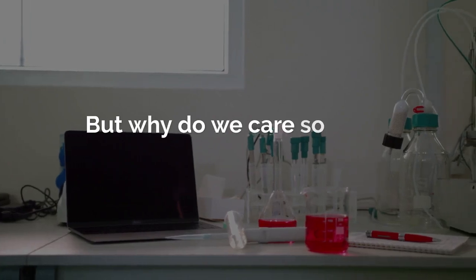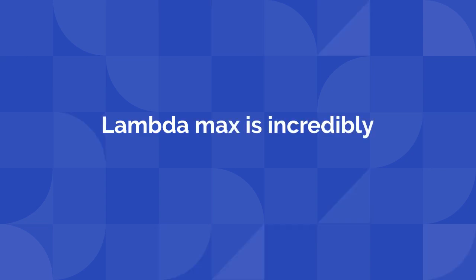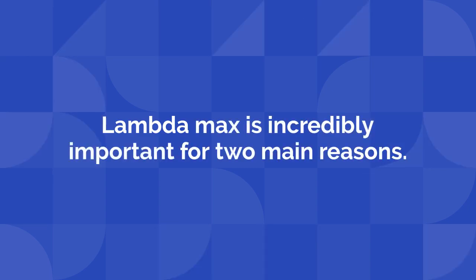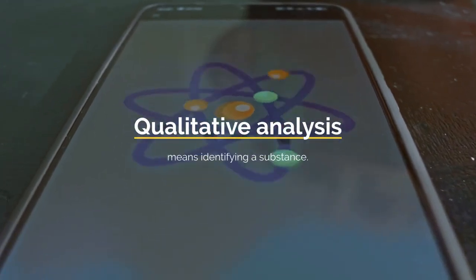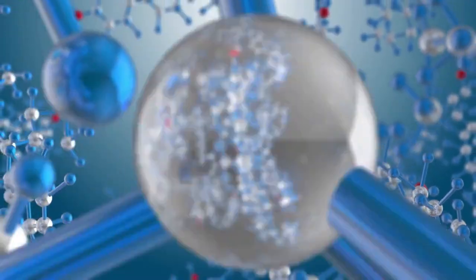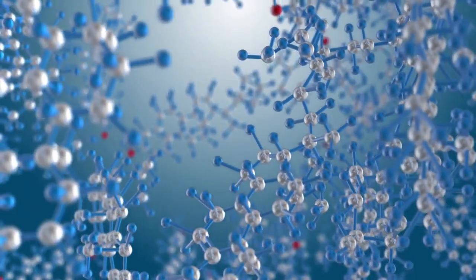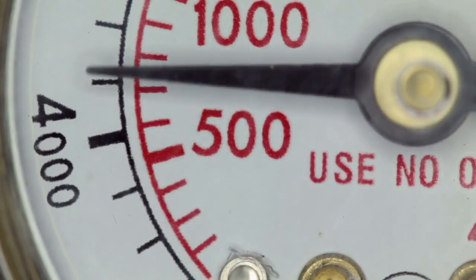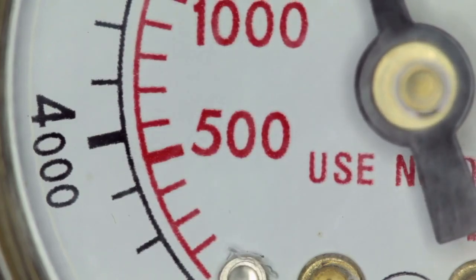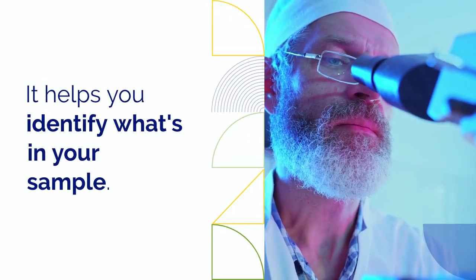But why do we care so much about this one specific point? Lambda max is incredibly important for two main reasons. First, for qualitative analysis, which means identifying a substance. Many compounds have a unique and characteristic lambda max, acting like a chemical fingerprint. If you are testing a sample and you get a strong peak at 273 nanometers, you have a good clue that caffeine might be present, because that's its known lambda max. It helps you identify what's in your sample.